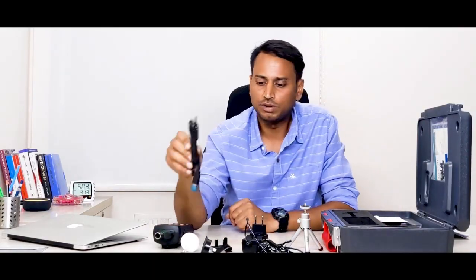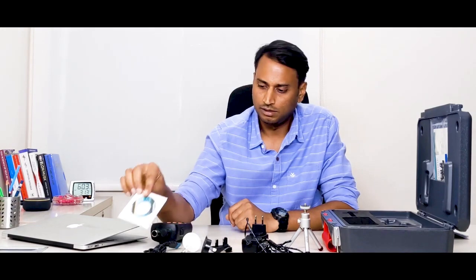We have also got a sampling tube for pumping operation, and this is the cable which is used to connect to the PC. So we also have software which can be connected to the PC. For this software, we need to use this CD.